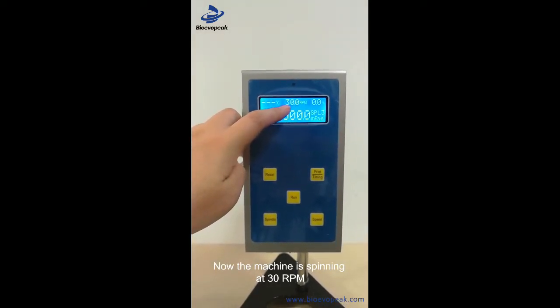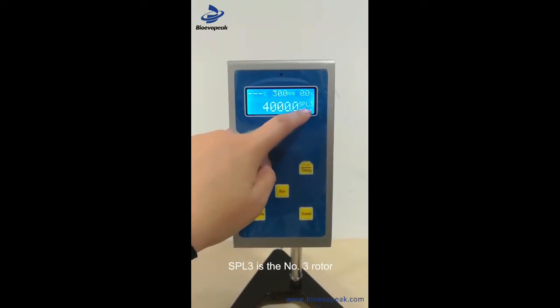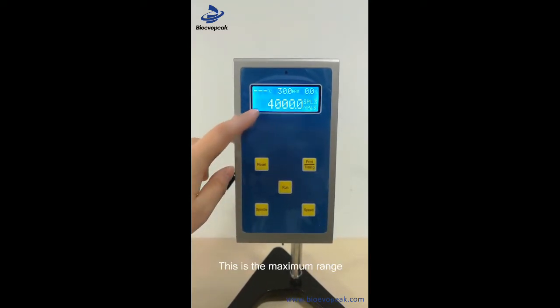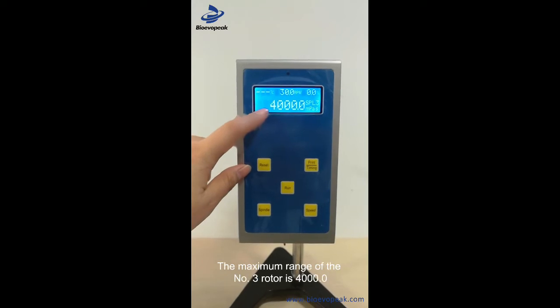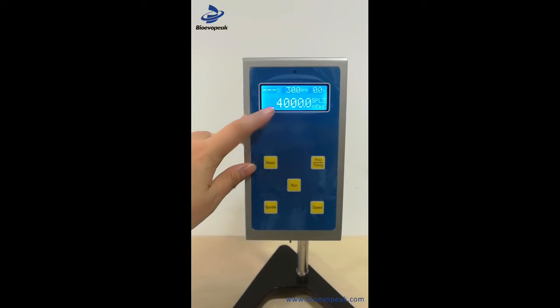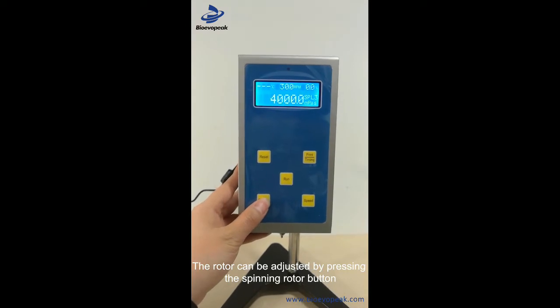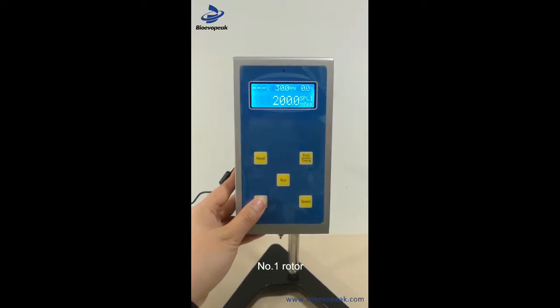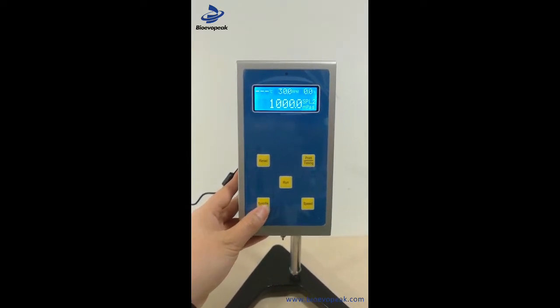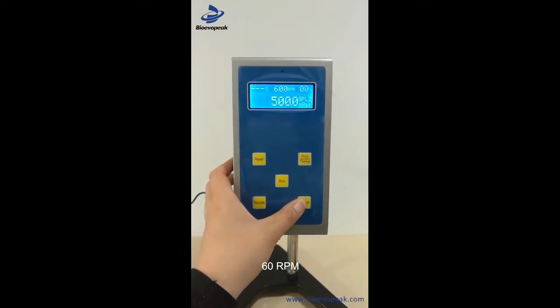The machine is now at 30 RPM. SPL is the rotor number — SPL3 means rotor number 3. The maximum torque at 30 RPM for rotor 3 is 4000. You can press the rotor key to cycle through rotors: rotor 4, rotor 0, rotor 1, rotor 2. Press the speed key to adjust the speed: 60, 6 RPM, 12 RPM, 30 RPM.